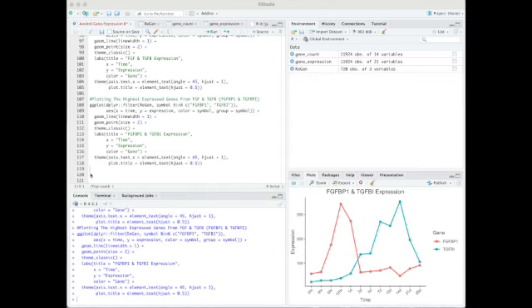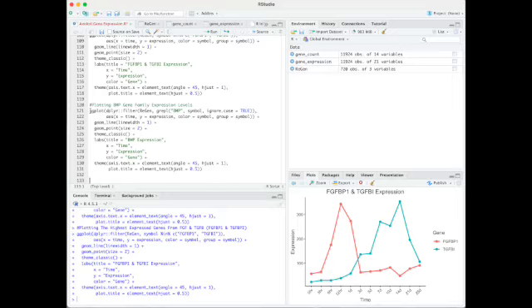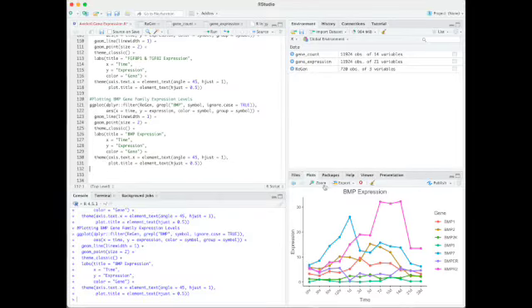Moving on, we will now examine BMP genes. With the same script from before, we will also use dplyr filter to filter in regen data and search with grep to find all BMP genes, while then plotting with ggplot. This graph is a great representation of the BMP genes.